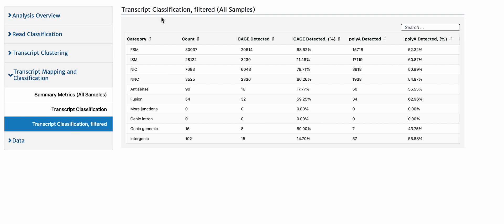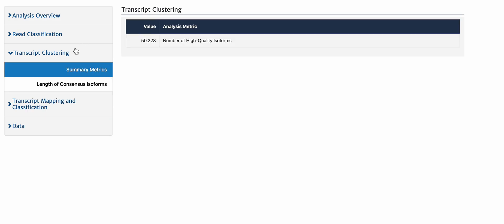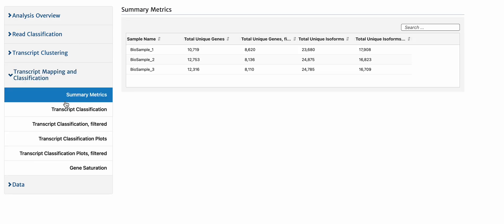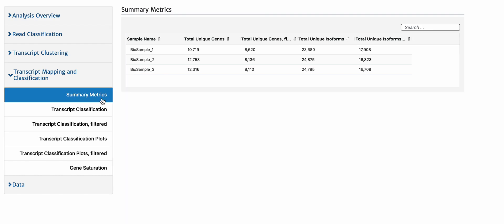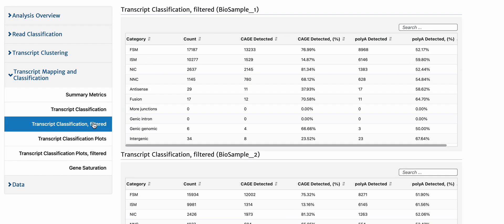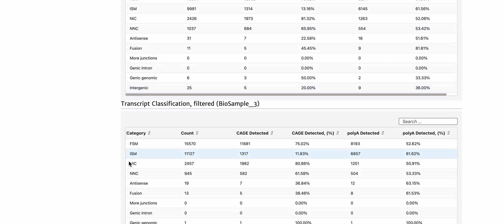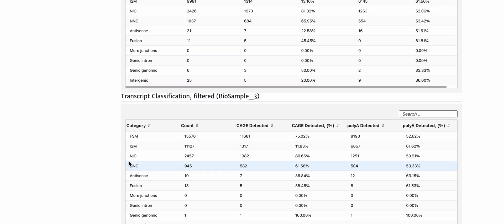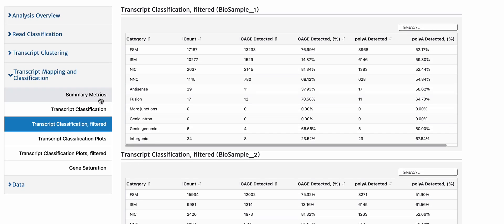If we contrast with what this looks like when you say cluster reads separately, when we get to the filtered results, the summary results look the same. But if we look at the classification post-filter categories, you'll notice that each sample actually has its own table, and that's because they've been processed separately to generate these tables.